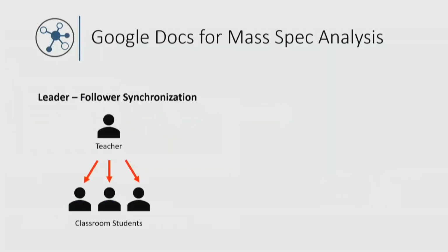But the really cool part to me that we've built out, and Danny alluded to this earlier, is this real-time synchronization. So the way we kind of convey this idea to others is Google Docs, but for mass spec data analysis. So you type in your Google Doc, you see the change, everybody else sees the change immediately. And so this is one of the things we've enabled in the GNPS dashboard.